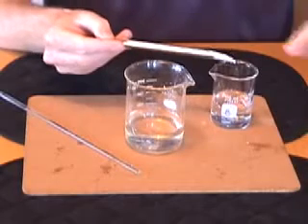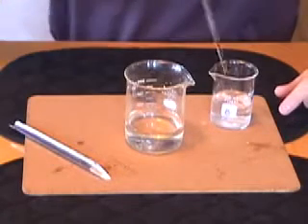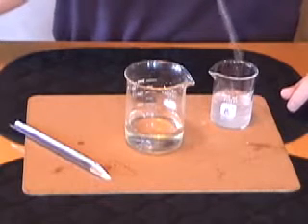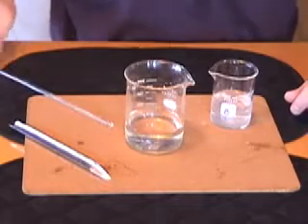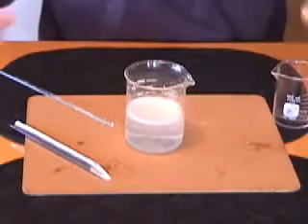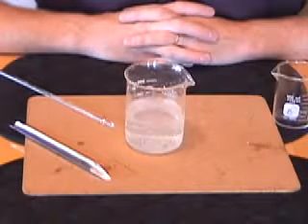Here I've got some sodium hydrogen carbonate on the spatula. I put it into solution and we'll stir it around a bit, and I'm about to place this aqueous sodium hydrogen carbonate into a 5% solution of acetic acid, which is CH3COOH. Sure, it's baking soda and vinegar, but what's the reaction? Well, now it's time to do some reaction chemistry.